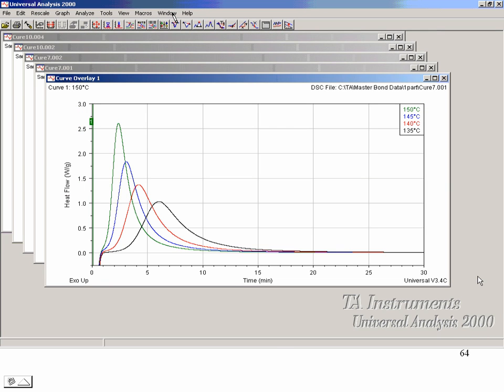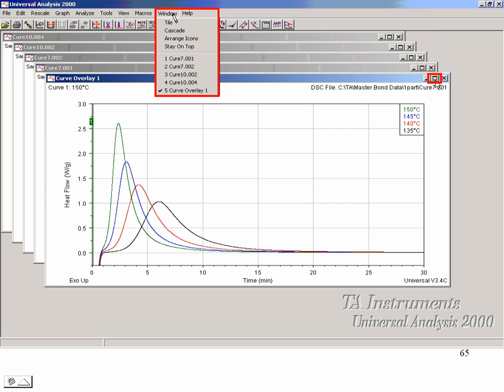Now, up until now, I've been showing everything full scale. This is a cascade view of the plots. If you want it to be full scale, this little icon right over here, this is standard Windows stuff, just press on that button there, and you'll get a full-size plot.